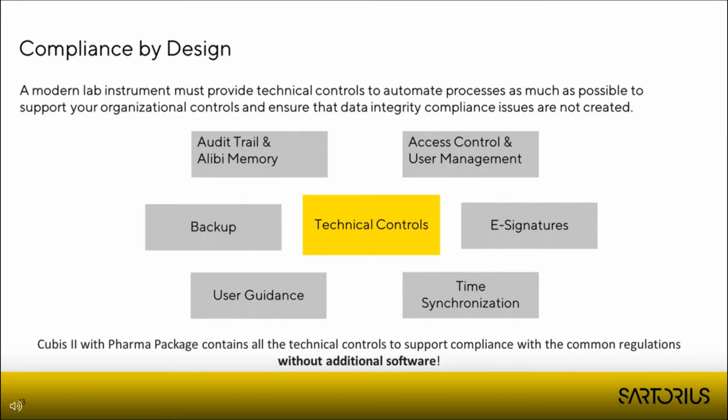Then it should provide an electronic signature functionality, an automatic time synchronization, so that you always have the correct time on the instrument, and it should have a proper digital user guidance so that your employees have to follow your SOP, that the data is automatically logged, and if there is any malfunction or any out of specification result, the user is warned.